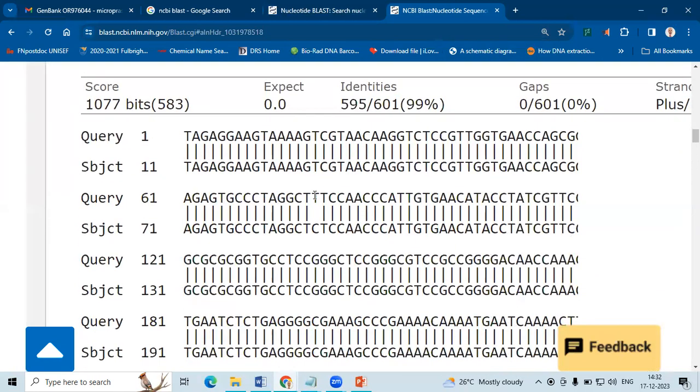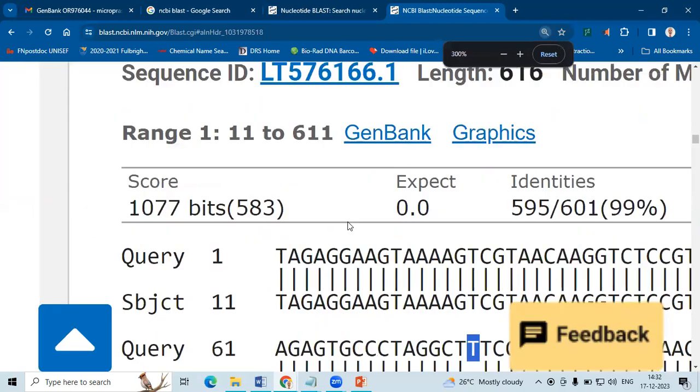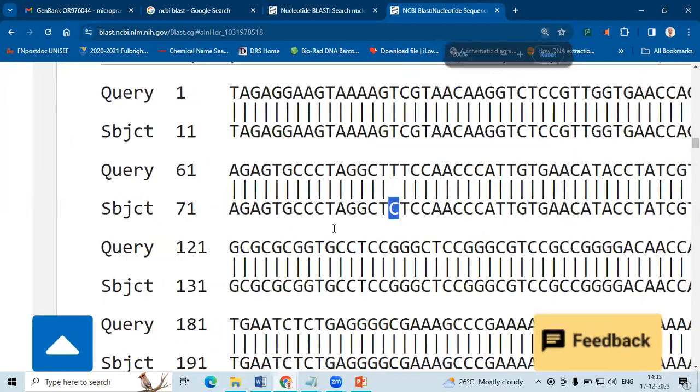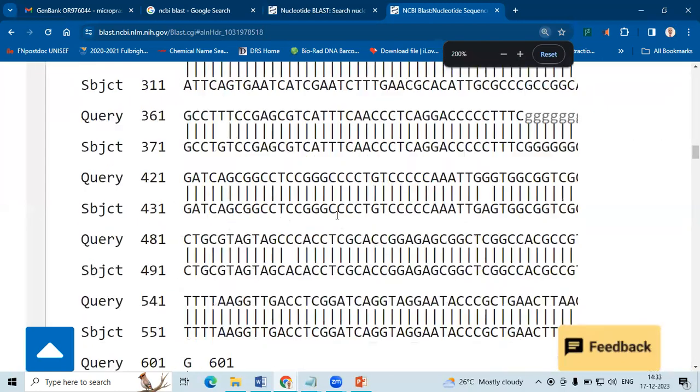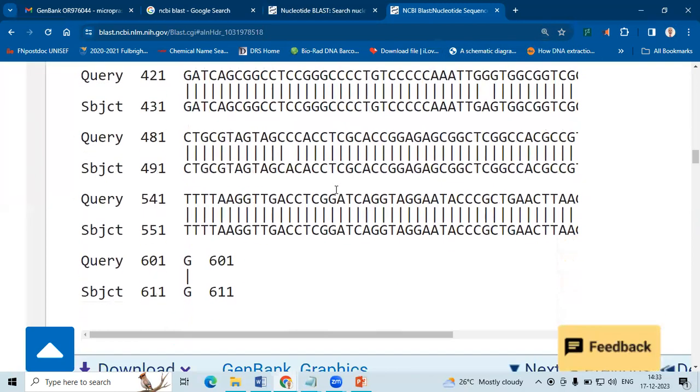Wherever you don't find a match, you will not have an alignment. So here we have C, here we have C.